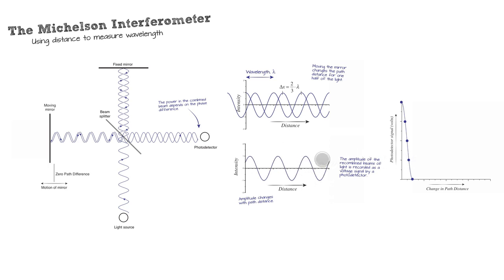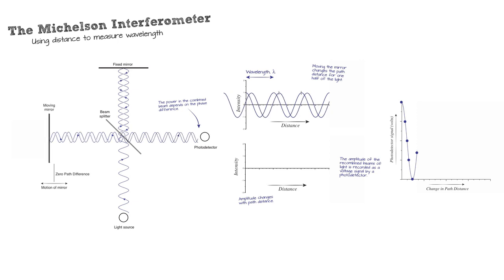Let's measure it. All right, so we're going to measure it. There's our value, and so let's put it on the plot over here. What do we get? Oh, look, we're coming back up in power. And so let's move it another third of a wavelength. All right, so we're going to get ready to move it a third of a wavelength here. There we go. What does that add up to? Oh, even more power. Let's measure that. Let's put it on the plot.